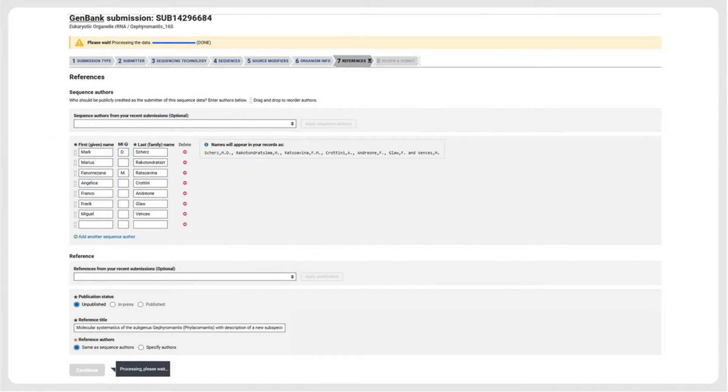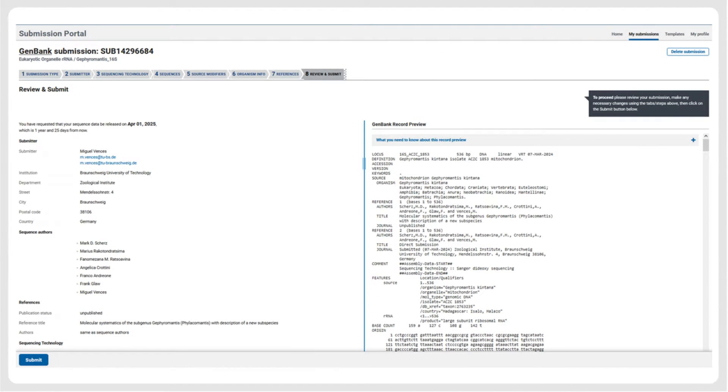On the next page, we have to specify the sequence authors and the title of the study. On the final page of the submission pipeline, the records are shown as they will be included in the GenBank database. After review, the submission can be confirmed and finalized.